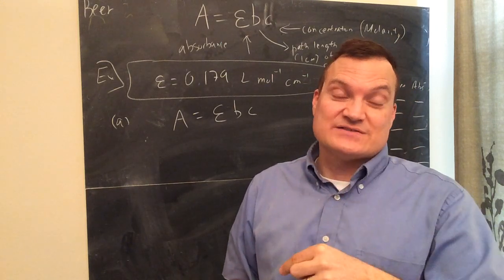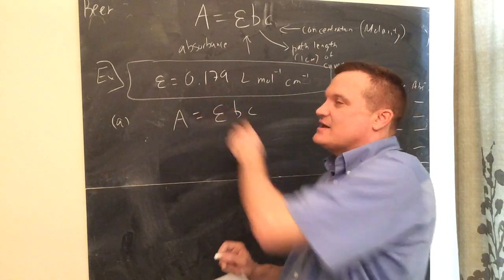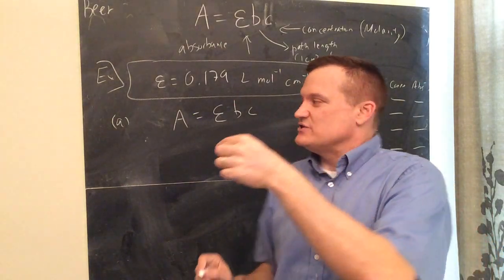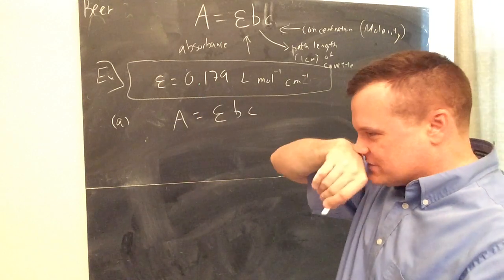What is the molarity of this red solution? So after you've done your lab, you found that constant. Then I get some in a container. I said, hey, tell me the molarity of this one. And you go, okay, what is that? So you put it in the machine, and it reads it.